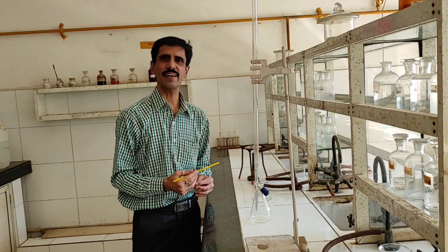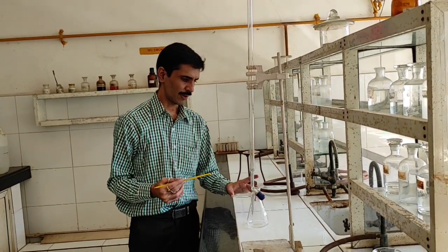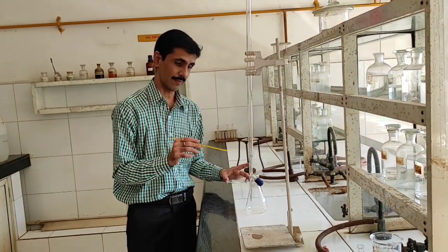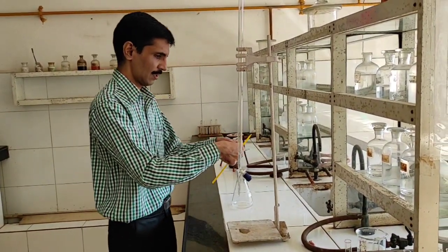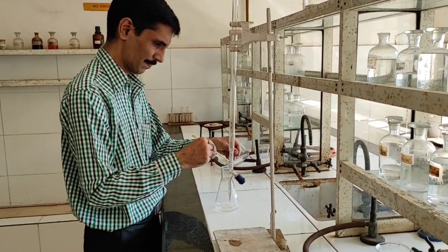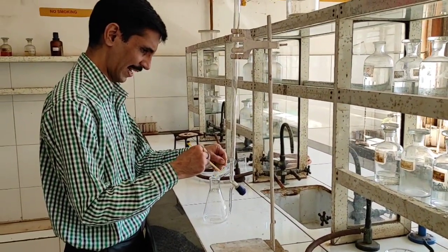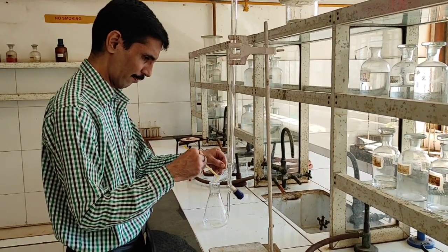Now, my dear friends, we start with the second part of the titration, and what we are going to do is weigh 0.5 grams of aspirin and dissolve it in NaOH. Alright, so here we go. In the first class, we have already measured aspirin. The conical flask contains NaOH, the normality of which is 0.5 normal.